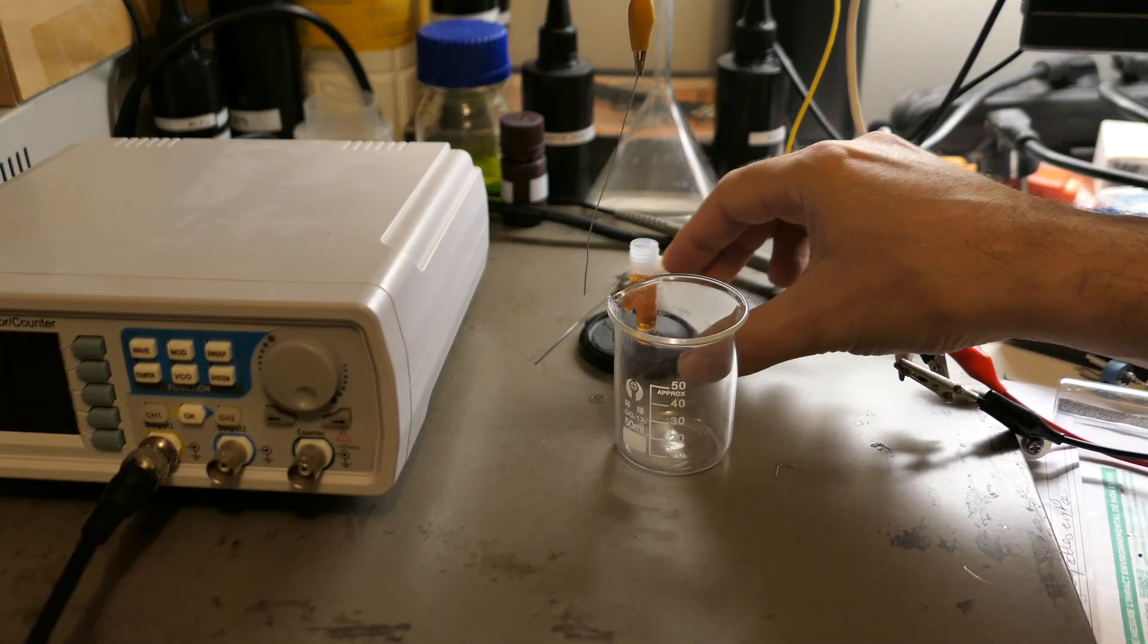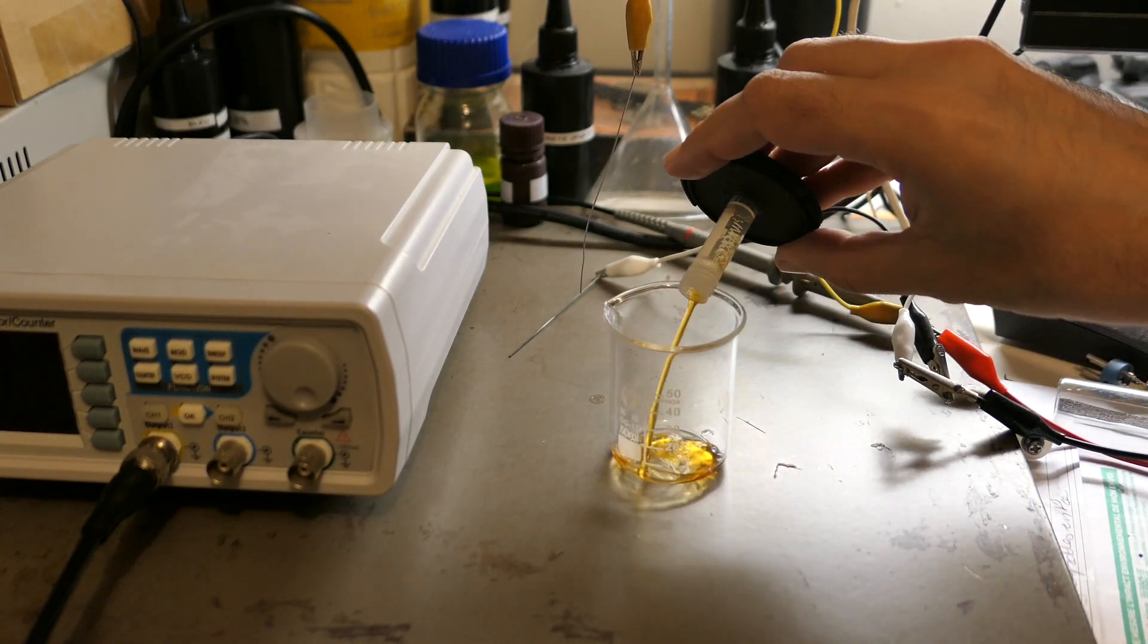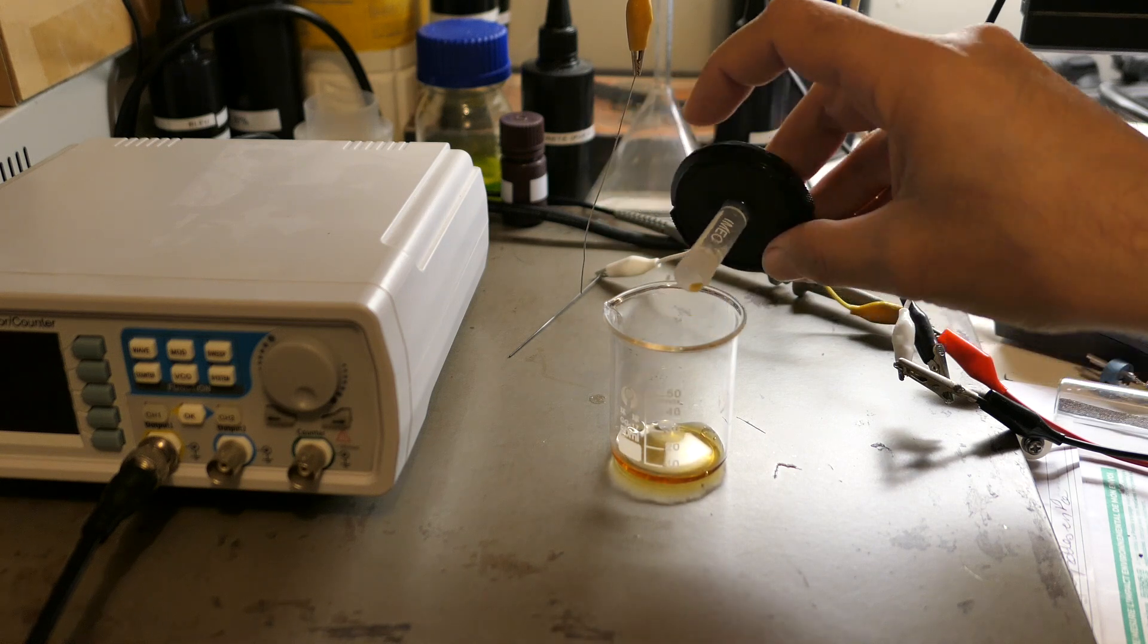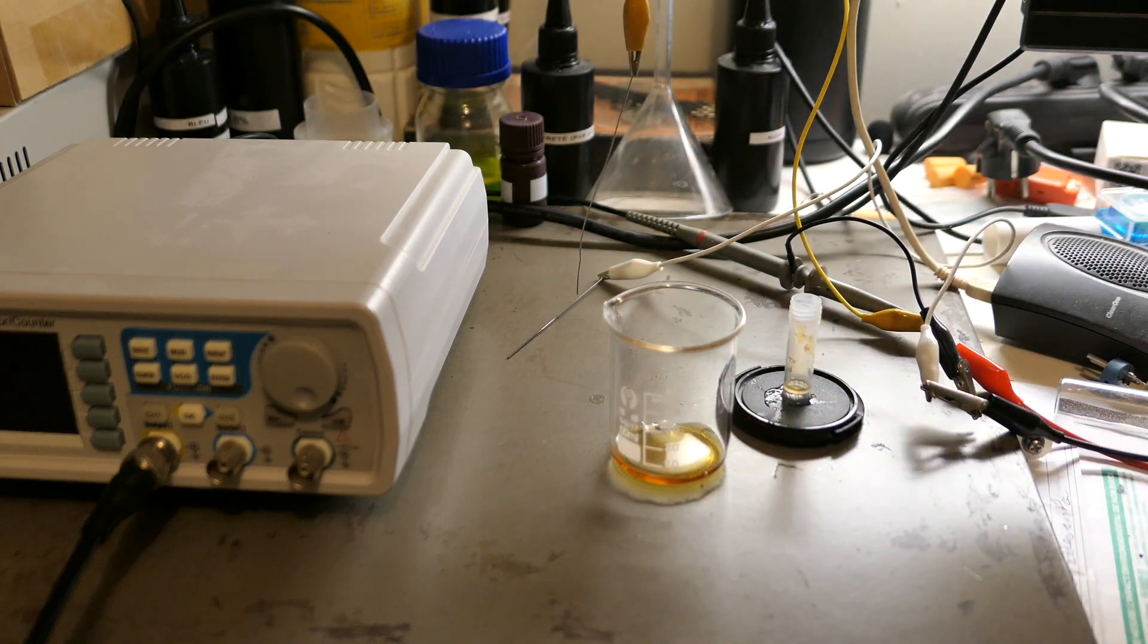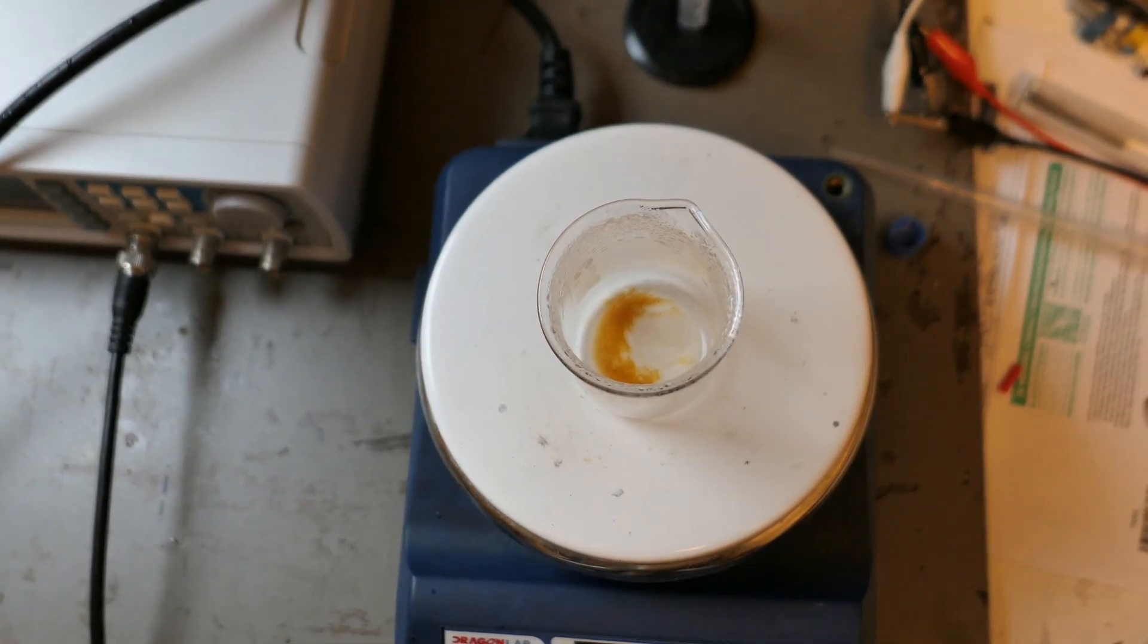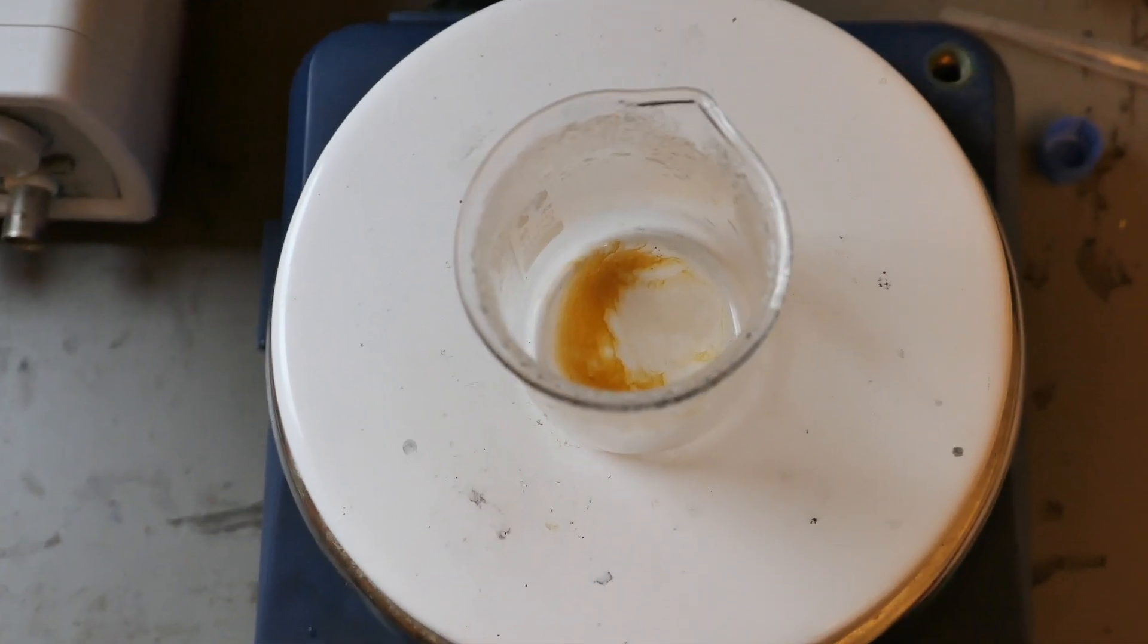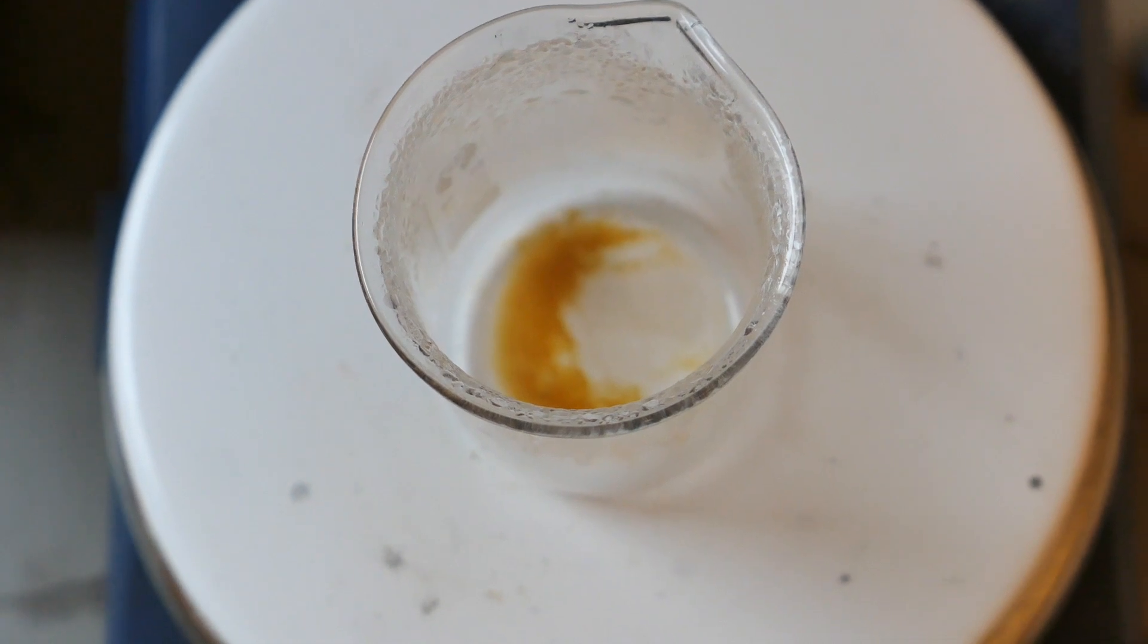Next, I'll evaporate the hydrochloric acid by heating the solution. The remaining orange residue is the hexachloroplatinic acid that has been formed. It's a small amount, but it's more than enough for electrode plating.